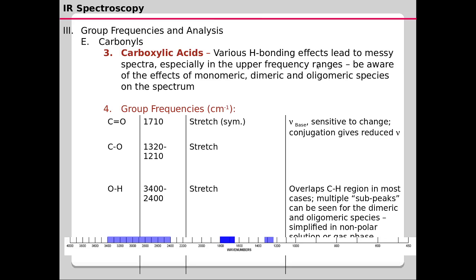And moving from esters to the carbonyl functional groups in carboxylic acids.